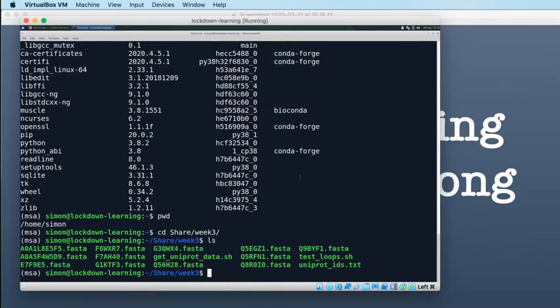And what I'm going to do actually is remove those, because I don't want wget to get confused by the fact that we've already got the files that we're downloading in our current working directory. It will re-download them, but wget by default will refuse to overwrite those files, which is fine. It doesn't really matter too much.